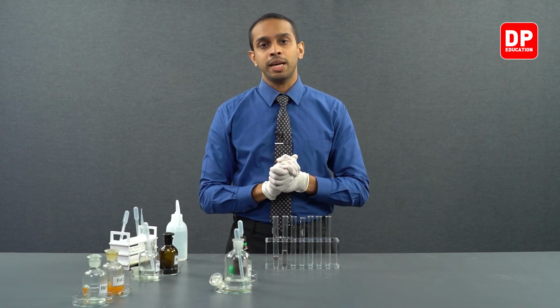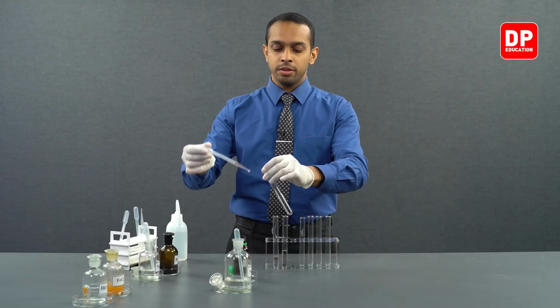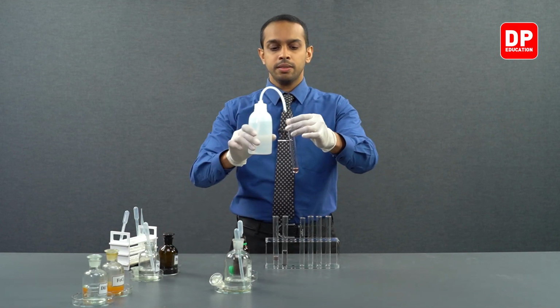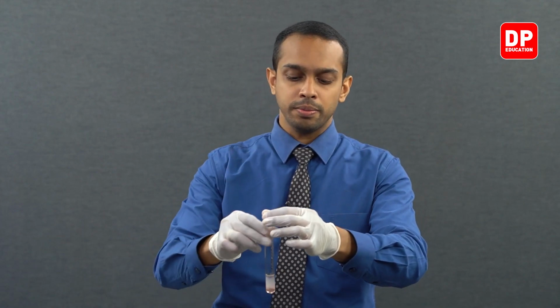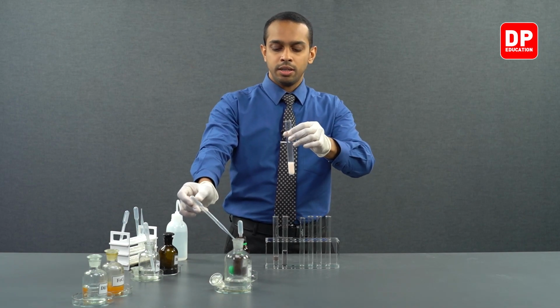Now, let us do the same test, but before we add sodium hydroxide, let us add a small amount of phenol and a small amount of water, and let us mix it really well. We can see some amount of phenol dissolves in water and creates this cloudy solution. And to this phenol solution, let us add sodium hydroxide.